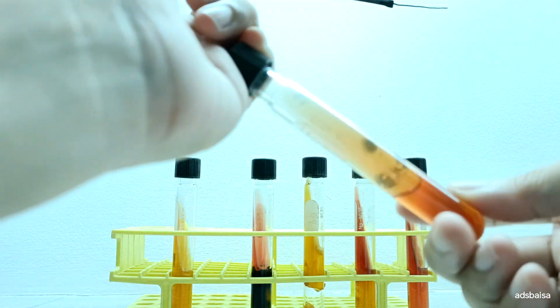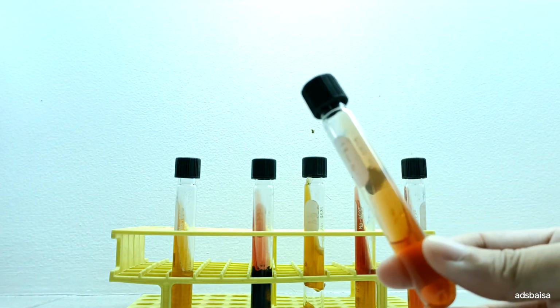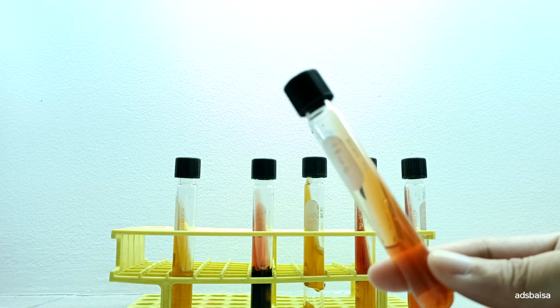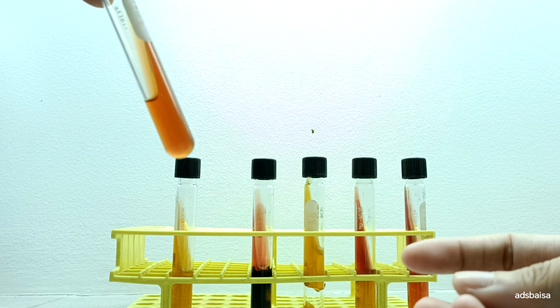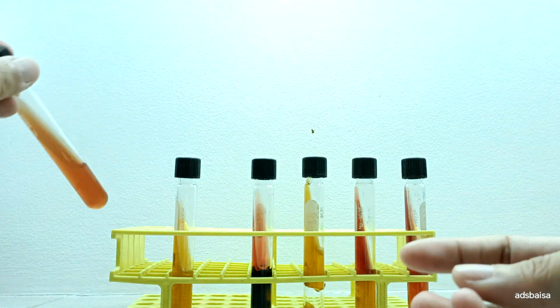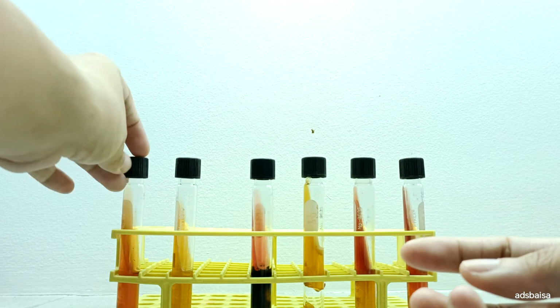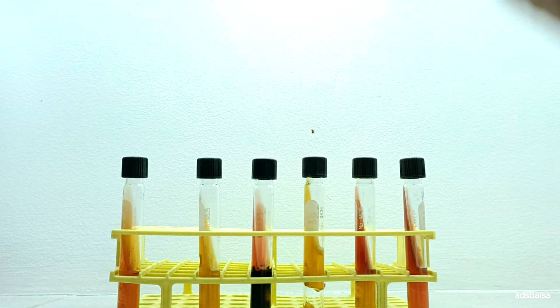Then cover your tubes. After that, you have to incubate it for 18 to 24 hours in order to detect the presence of sugar fermentation, gas production, and hydrogen sulfide production. There are different reactions that may occur using the TSI agar tube.